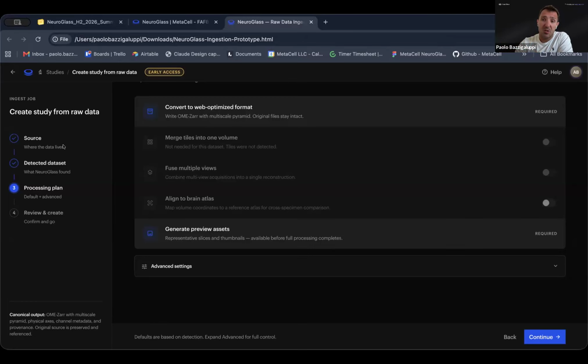The way we are conceptualizing this pipeline is giving users the possibility to identify the source and fill in some metadata, then land on a page where they can perform some pretty common pre-processing steps, like tiling. Many of these data sets require stitching of tilings that rely on sometimes custom, sometimes more standard pipelines. So we mean to merge and include these pipelines in the acquisition workflow.